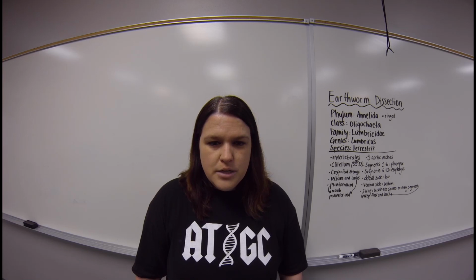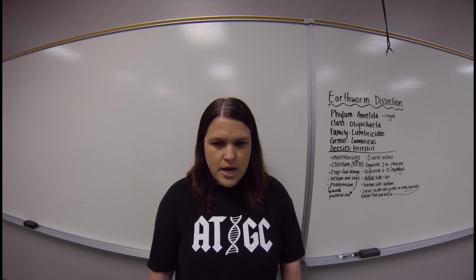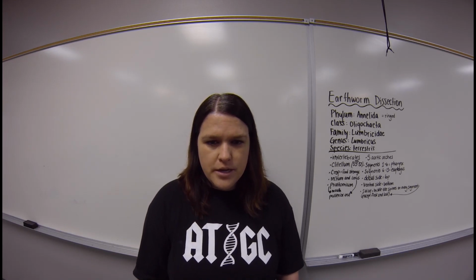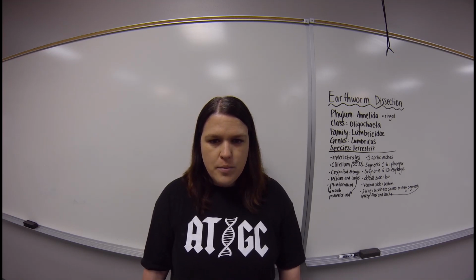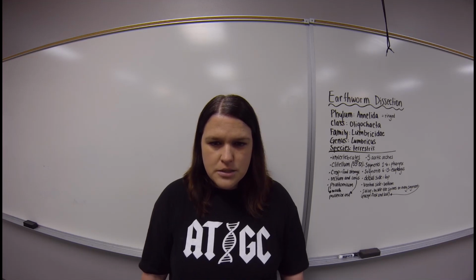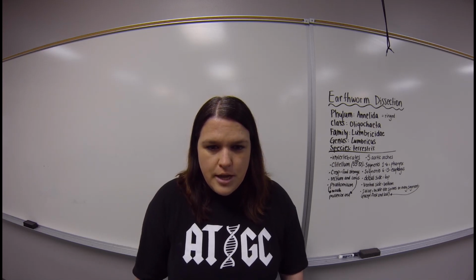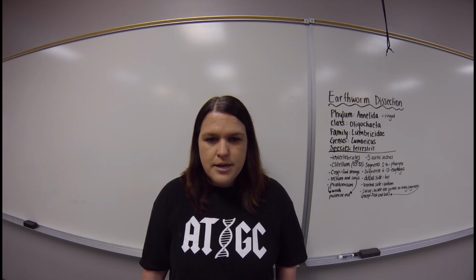The earthworm takes in a mixture of soil and organic matter through its mouth, which is the beginning of the digestive tract. The mixture enters the pharynx, which is located in segments 1 through 6. The esophagus, in segments 6 through 13, acts as a passageway between the pharynx and the crop. The crop stores food temporarily. The mixture that the earthworm ingests is ground up in the gizzard. In the intestine, which extends over 2/3 of the body, digestion and absorption take place. Soil particles and undigested organic matter pass out of the worm through the rectum and the anus.